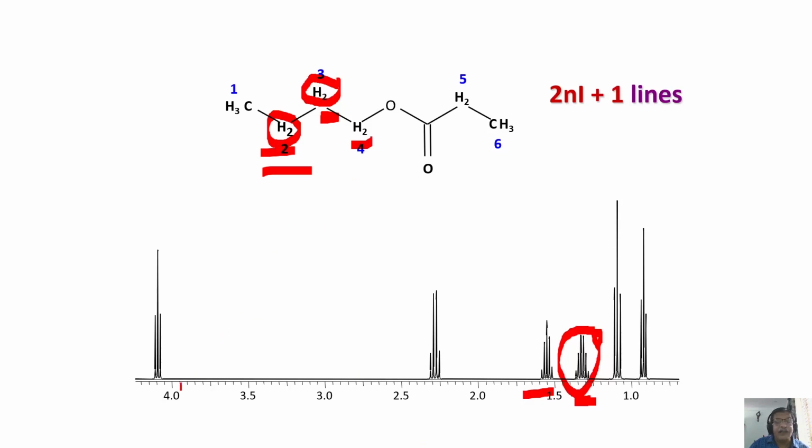Now, what is leftover, this CH2 is this one. This is coupled to this. It has to be a triplet. So we assigned this quartet because of this. Now only thing left over is these two CH3s. Which one is which, that you can assign by making the J coupling measurements. Very easy. You can do that. Either here or there in the multiplicity, this multiplet or this multiplet, measure the couplings, you will know which CH3 is which.